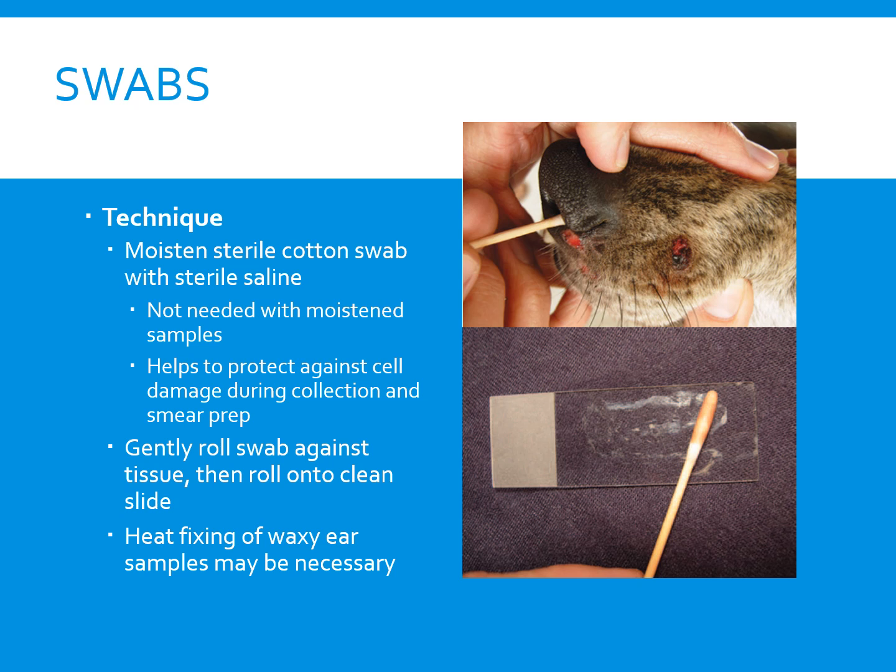Passing the slide briefly through a flame or gentle heat from a warm hair dryer may be used to dissolve the wax. And we also use a lighter. Excess heat must be avoided because it will destroy the cellular components of the sample. Aside from the gram staining procedure, this is the only circumstance under which cytology samples may require heat application.